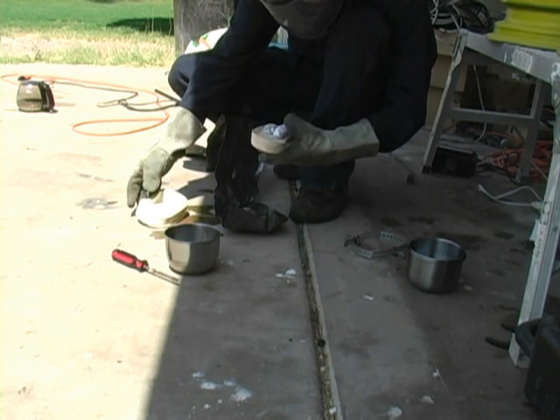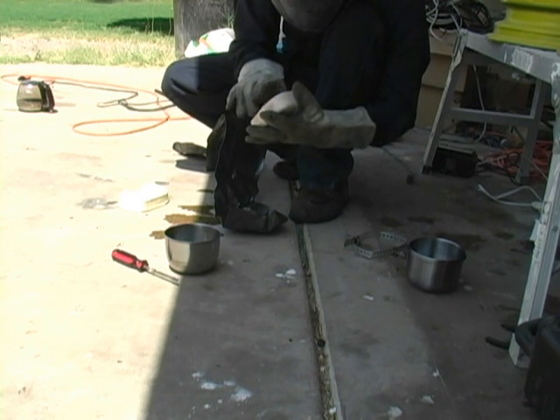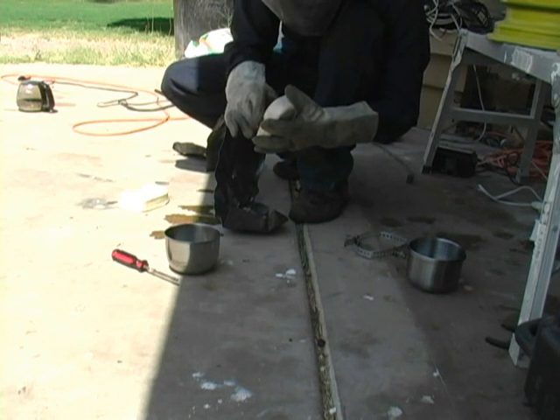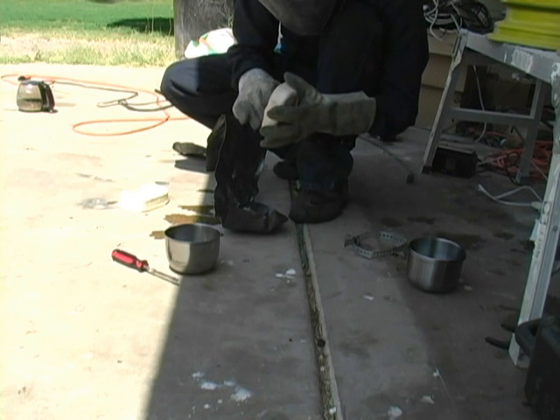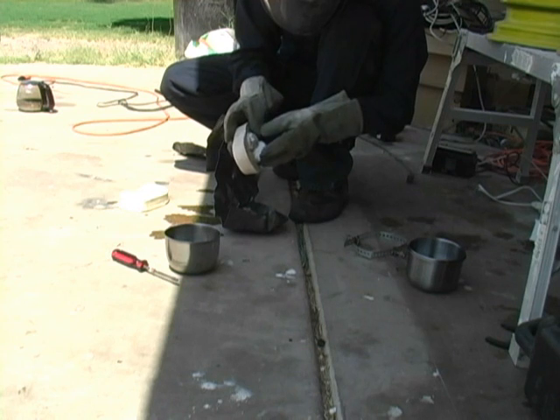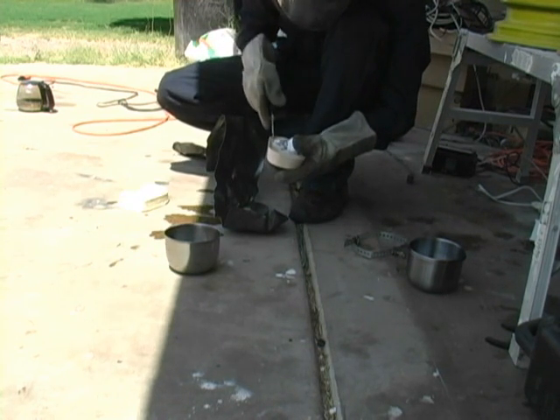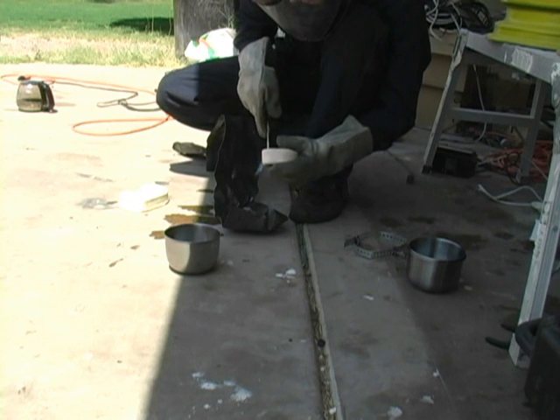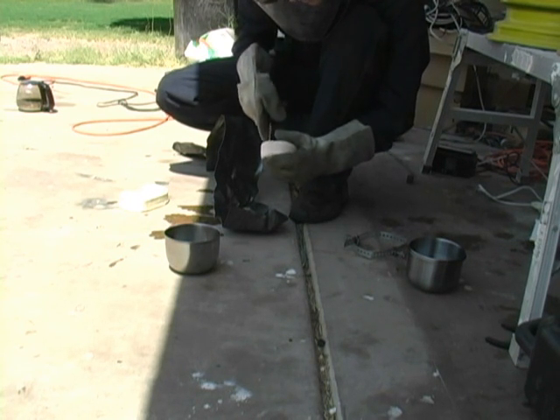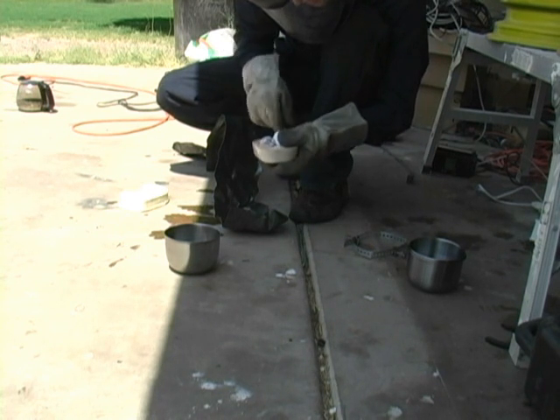Looks semi-decent. Now when you pour sodium through hydraulic fluid, if it's not quite hot enough, you get a lot of beads. It appears we may have done that.